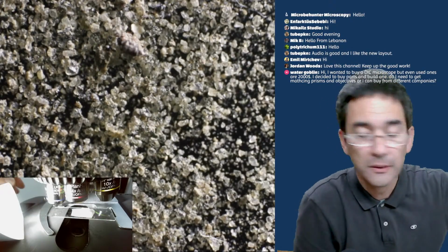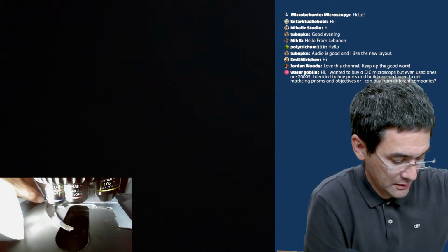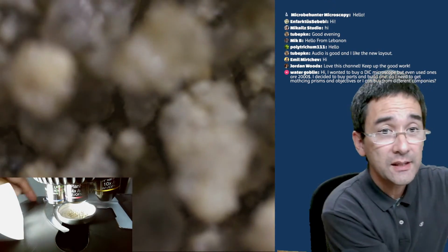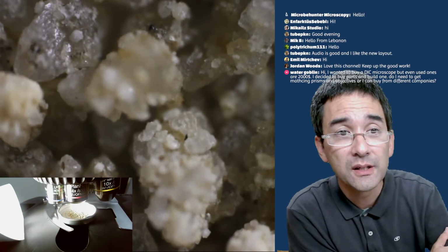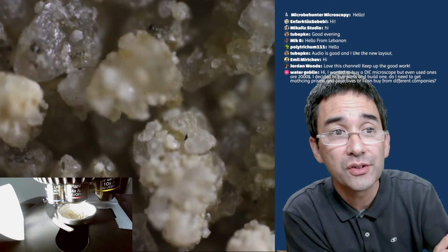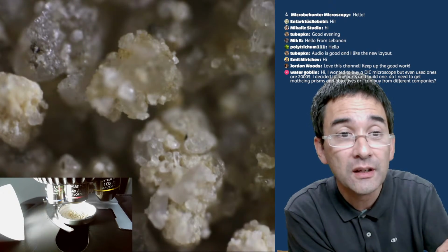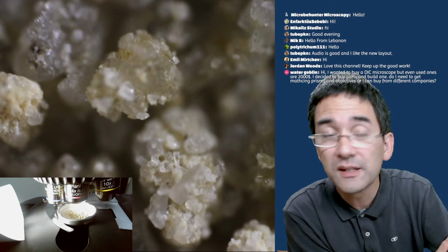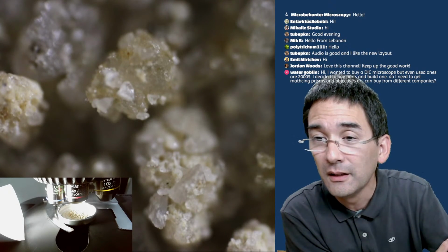I'm going to do the following here. Just take it away. And when I put this one directly under the microscope like this, then this of course also works. See that some of the sand grains are still stuck together, because the sand was a little bit wet and moist, and therefore it's stuck together. I already see a few comments. Okay.